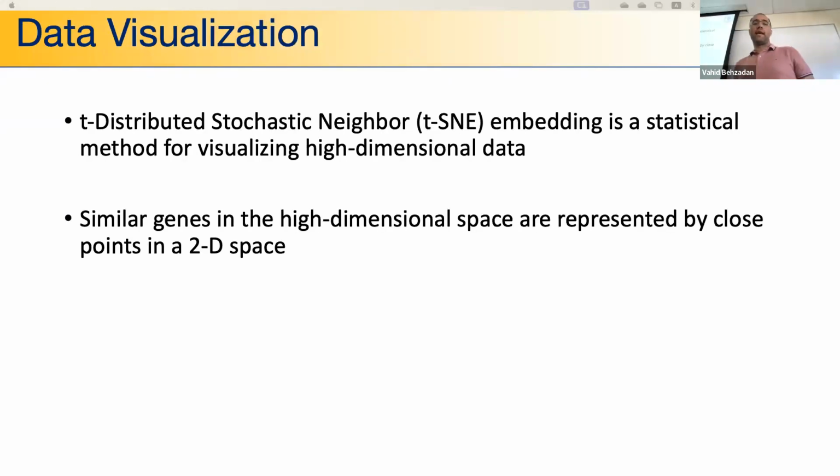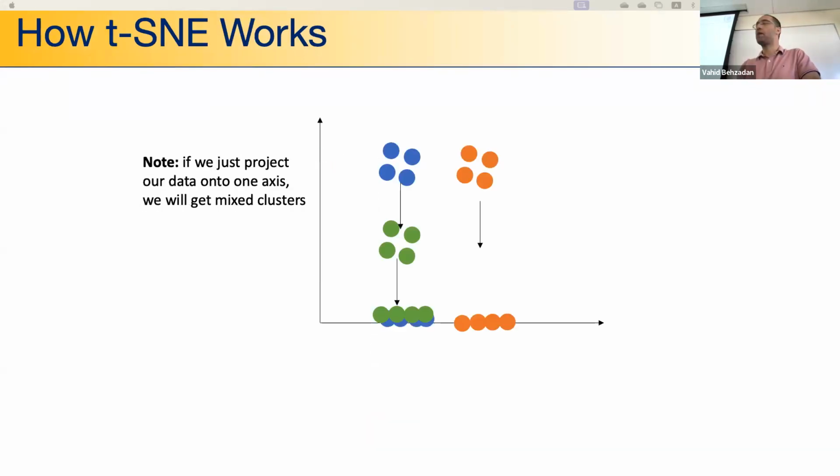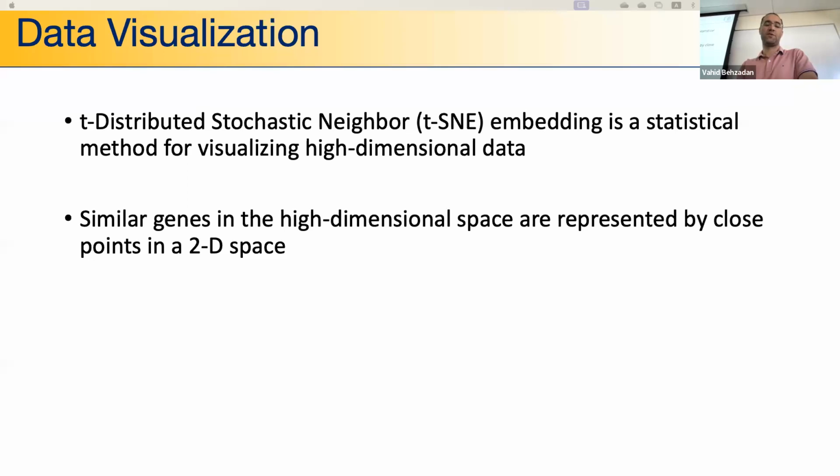And then we can visualize our data set using t-SNE. Are you familiar with t-SNE? Okay. Just to be on the safe side, can you give a one-liner of what t-SNE does? Yeah, actually, I have slides of how it works. I just wanted to know whether you're familiar with it or I need to go deeper.